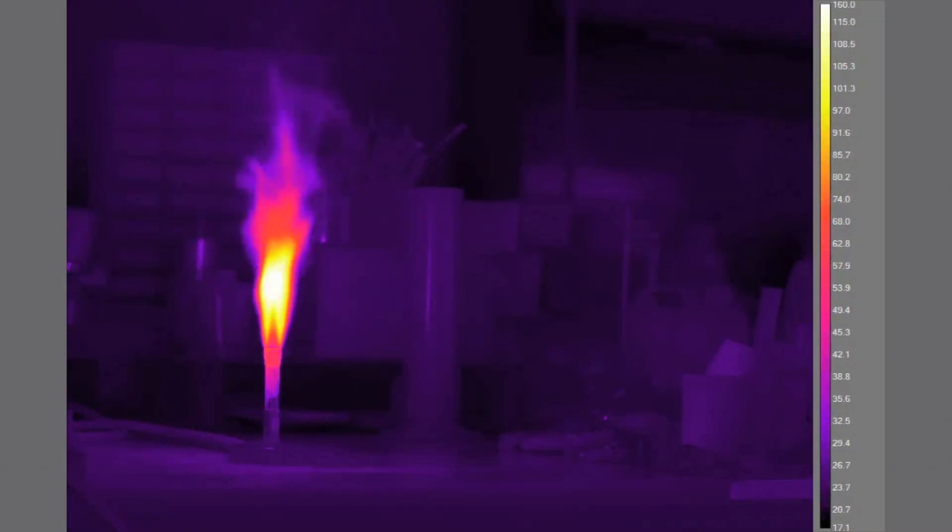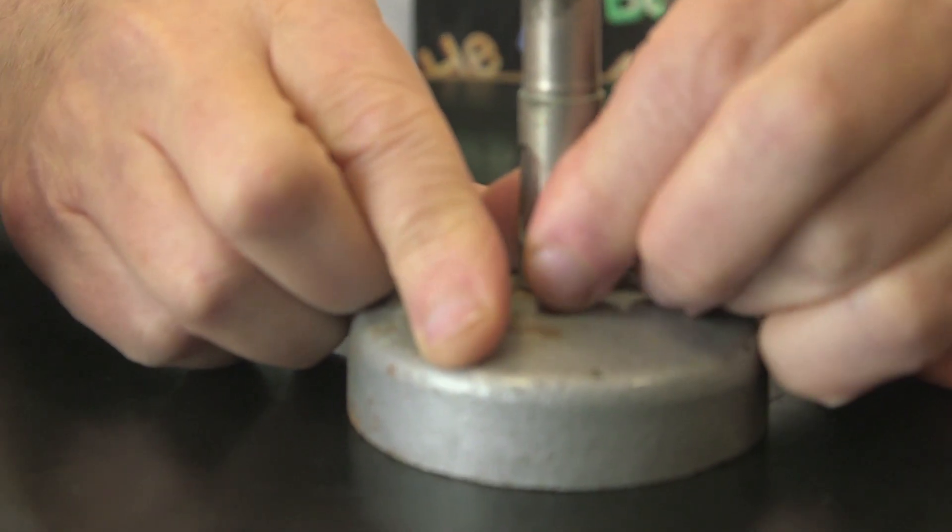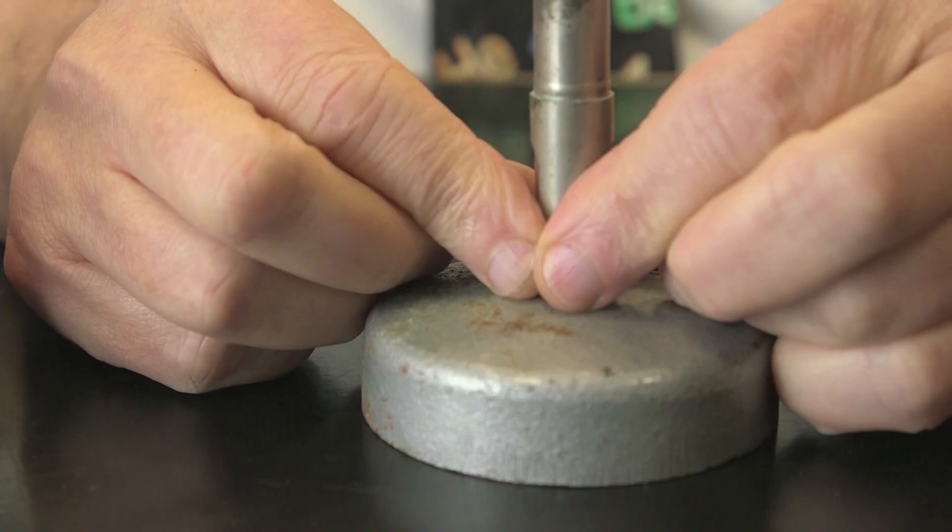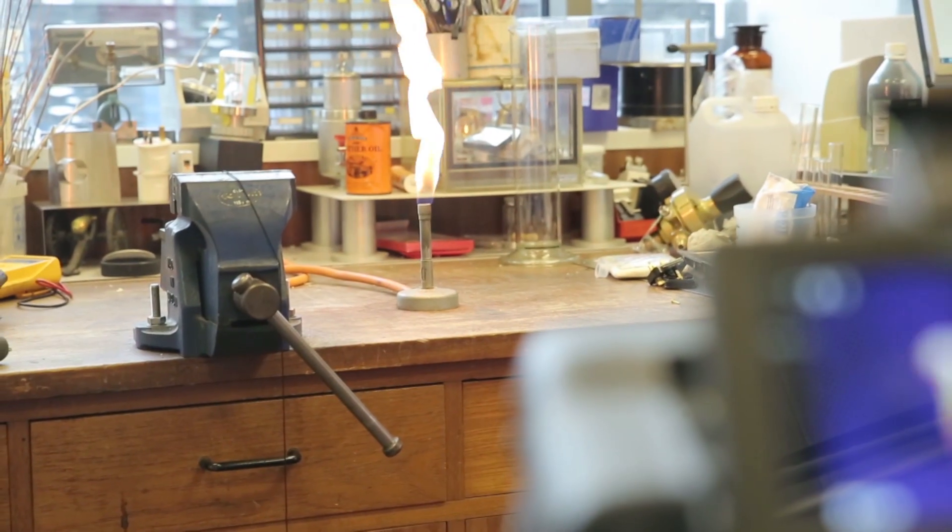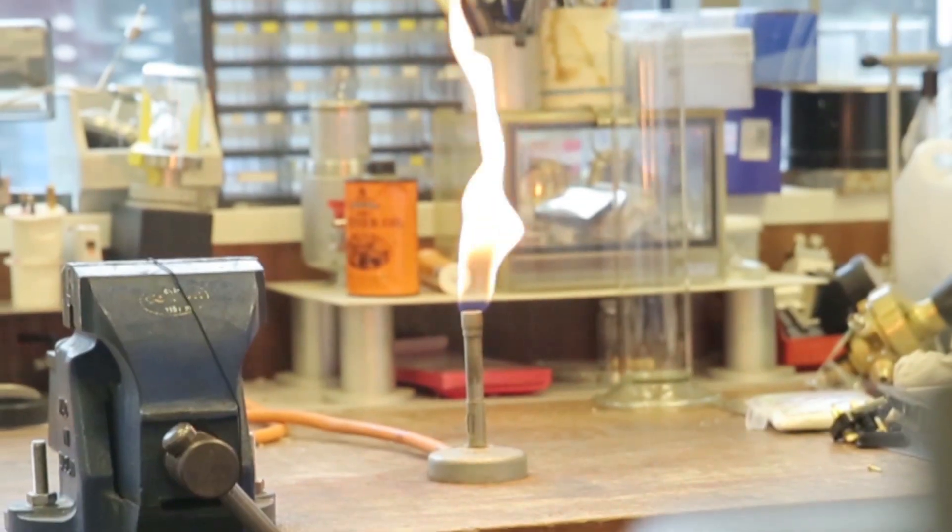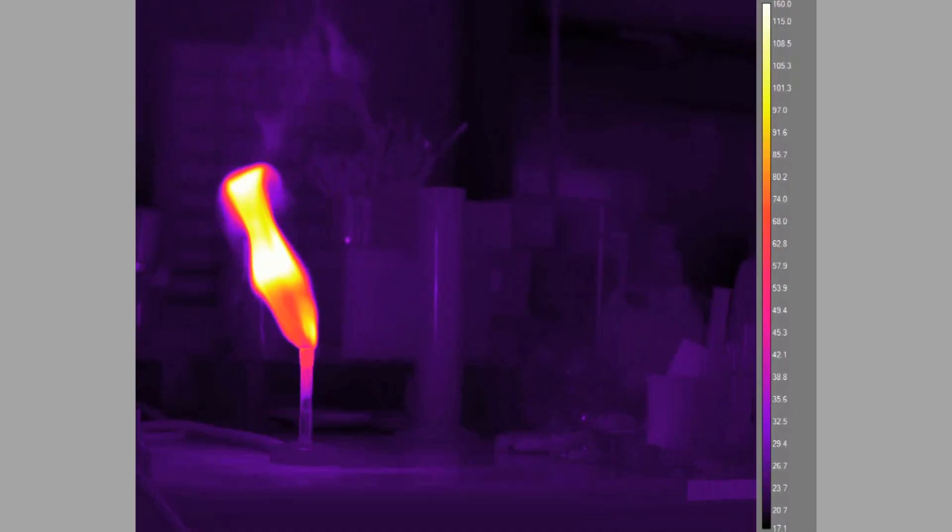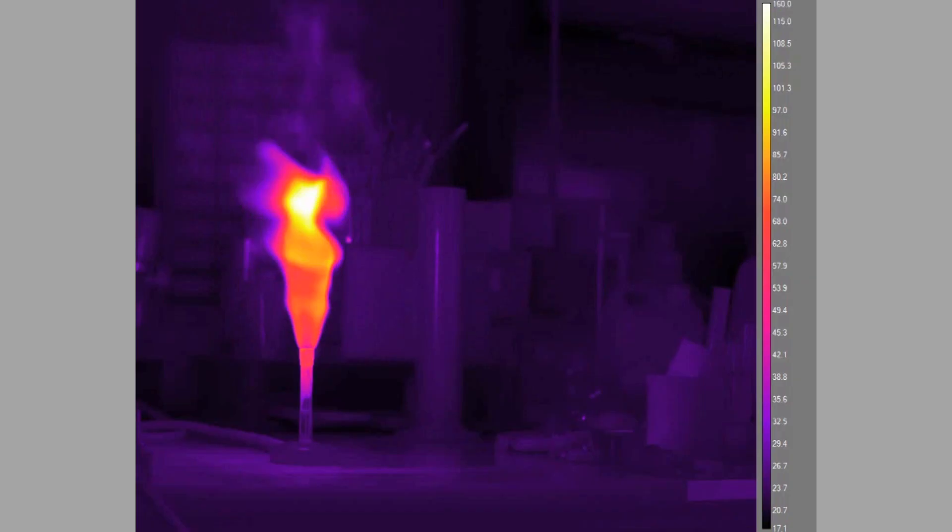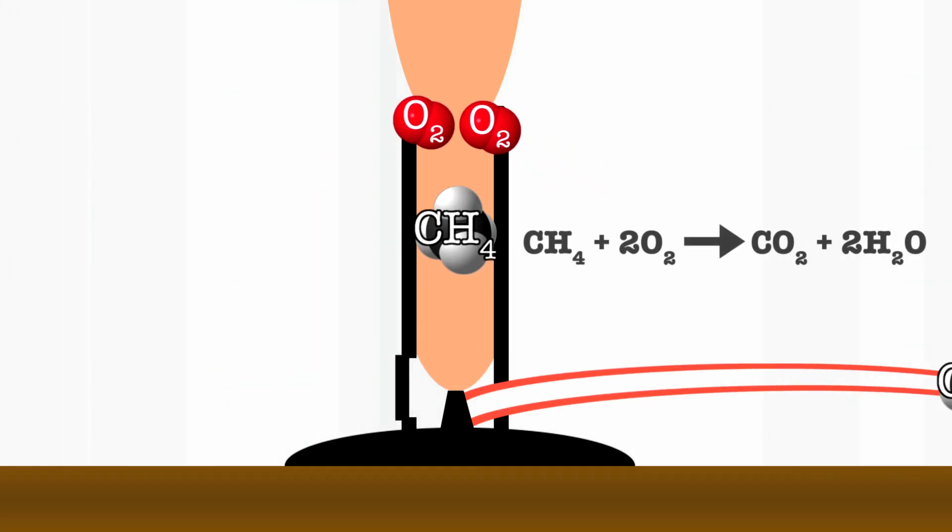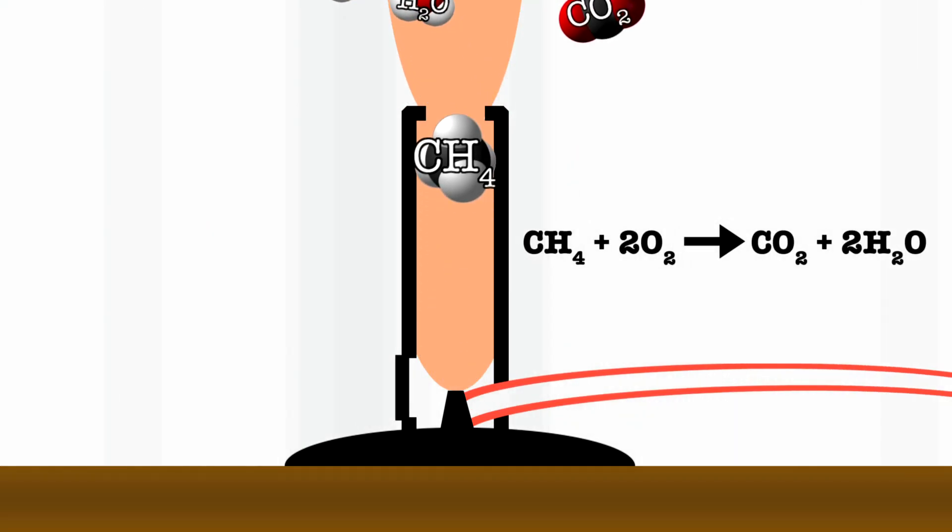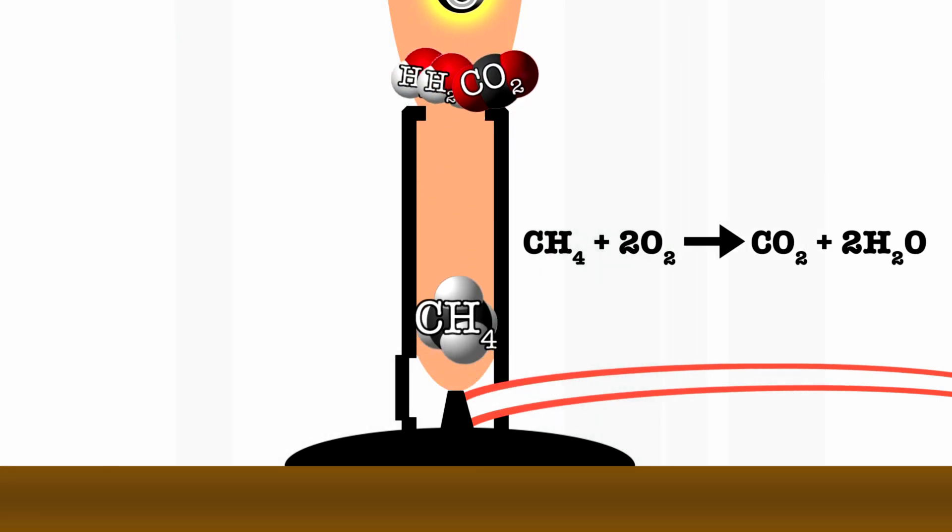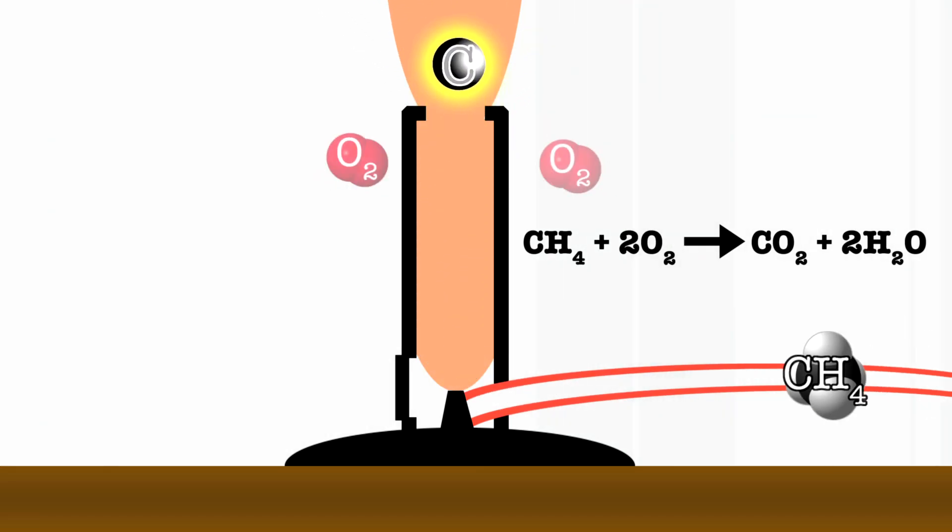So Bunsen burners are usually used in two different modes. There's the mode where the air holes are covered up and you get quite a large yellow wavy flame. The yellow color is from hot carbon particles which are radiating out heat. In the cooler mode, when you haven't got much air, the gas comes up and catches fire when it comes in contact with air. The heat of the flame generates carbon particles from incomplete combustion of the methane, which is in the gas, and eventually those particles burn.